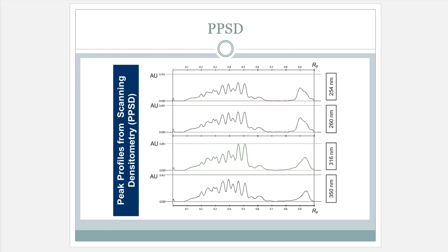So notice, though, that these are not very clean. This is not what I would call resolute. It's not what we would typically refer to in the chromatography world. So there is a slight difference. But what I do see are peaks, and something here, and something there, and something here, and something there.